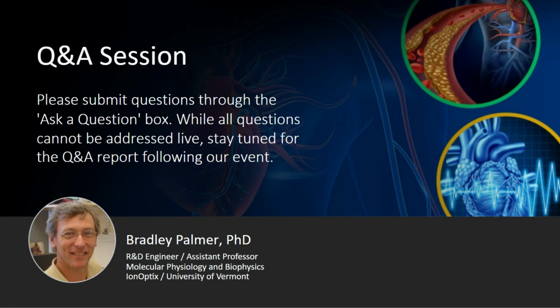Could you please provide details on the adhesive and relaxing solution that you used to fix the heart prior to slicing? I could give you all those details verbally, but it's best for you to go to the Resources tab and check out those references that I have with a special asterisk. There you'll see all the recipes for the solutions that could be used for either relaxing solution or dissecting solution, or for recording solution. That is just a basic solution used for recording intact muscle.